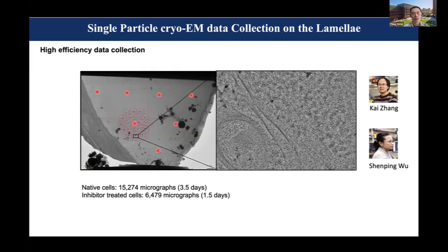And this is actually very efficient, almost like your purified sample. We can get 4,000 to 5,000 single particle micrographs per day for data collection.